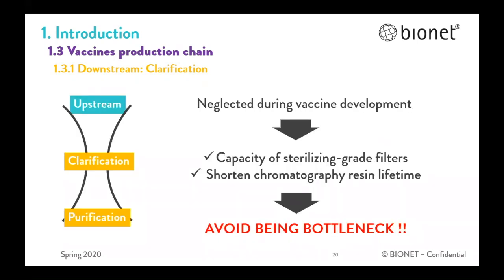The clarification step is sometimes neglected during vaccine process development because time and resources are more focused on production and purification steps. However, clarification efficiency directly influences the performance of the downstream process.